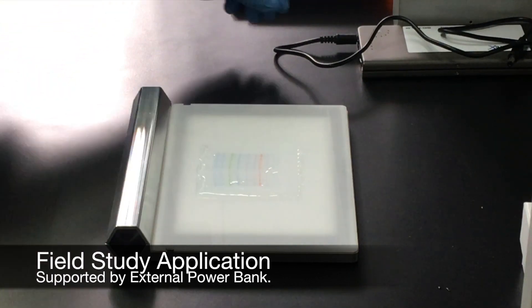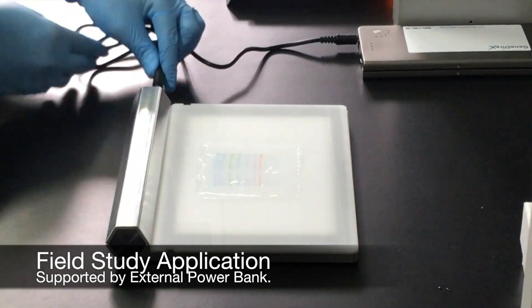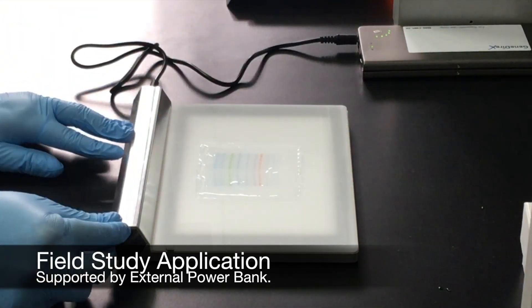Field studies can even be easily performed by simply plugging the blue pad to the power bank.